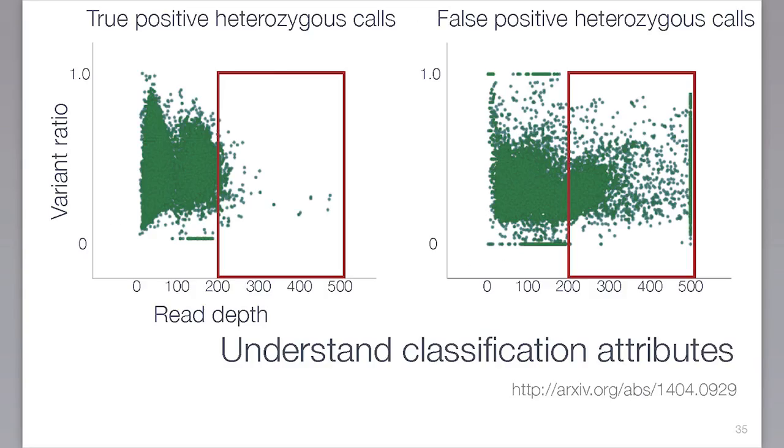But actually, let me skip forward. Maybe more importantly, you can learn something new. You can write your classifier and say, okay, based on this data, here's my new read data. Tell me which ones you think are likely true positives and which ones you would filter out because they don't match any of the criteria of the other variants. And as attributes, you can use just about everything you want. What is the context? What does the genome look like around the position where I call the variant? How many individual observations do I have that support this? Is there any positional bias on where this variant is being called in the reads? Is this only being called in reads where it shows up in the beginning? There are many different parameters, probably 20 or 30, that you can use.